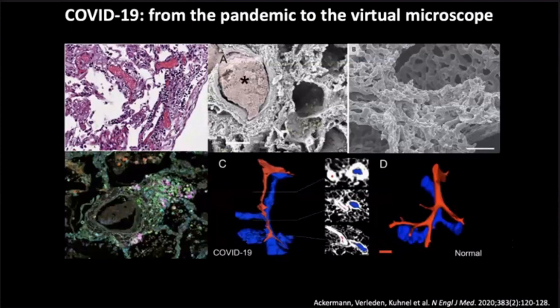And I think Danny and Max made tremendous efforts there in establishing the disease that was going on in the vasculature, because we saw these obliterations of the vasculature that were really destroying the lung specimens. And back then, the only thing we had was just a micro-CT scan of the tissue. So these are just some very simple reconstructions of what was going on. In blue, you can see the airway.